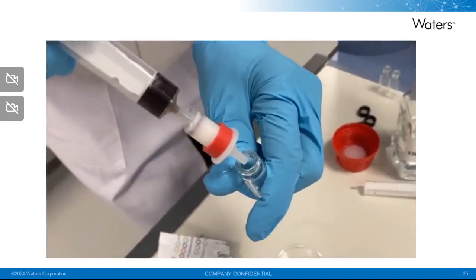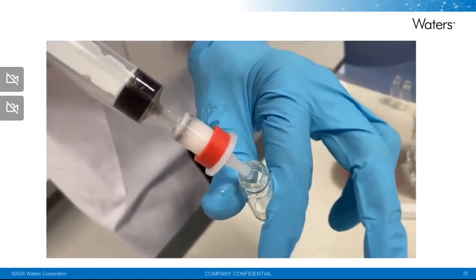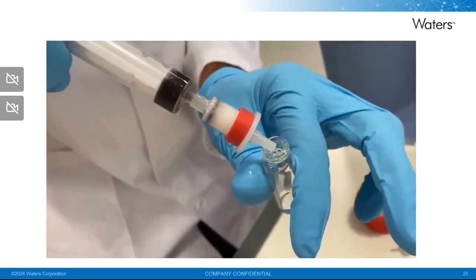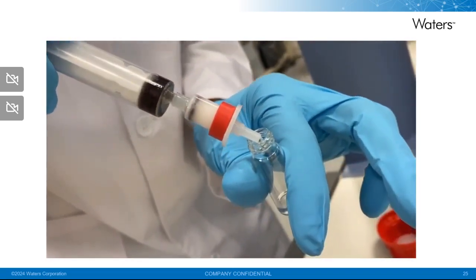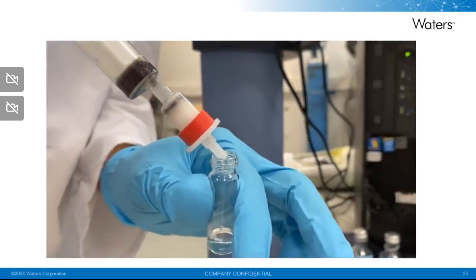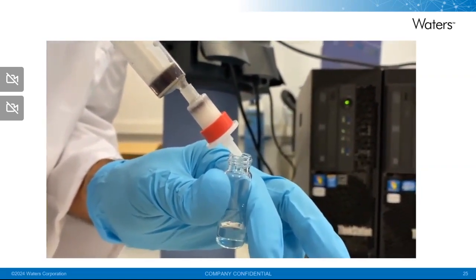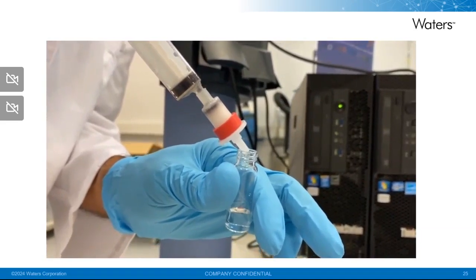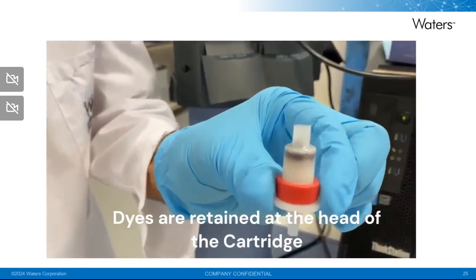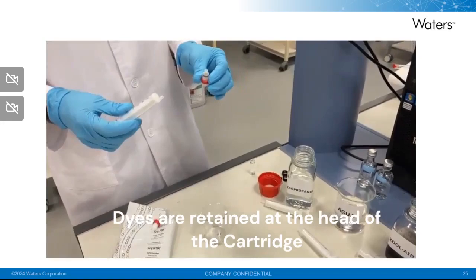Please note that the dyes, which are relatively hydrophobic, are being retained on the top of the cartridge, while what is eluting from the cartridge has no color. It is perfectly clear, and this is containing the more polar components such as sugars or some organic acids. You can see clearly the color of the dyes on the top of the cartridge and the liquid with no color that we have collected.